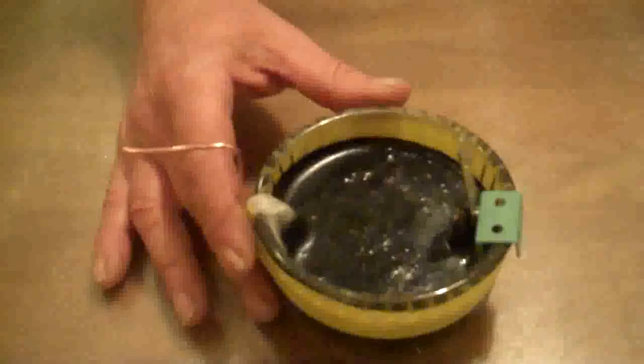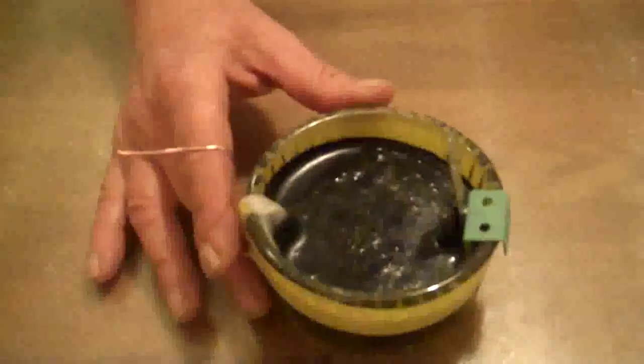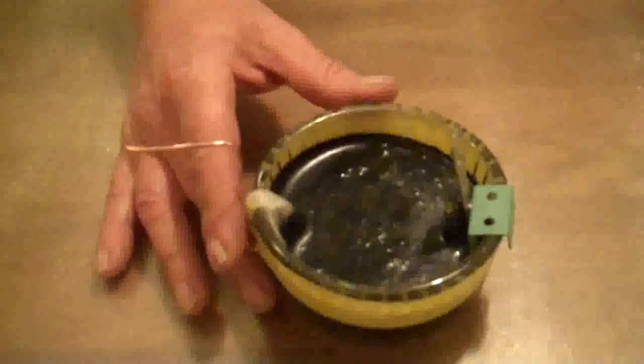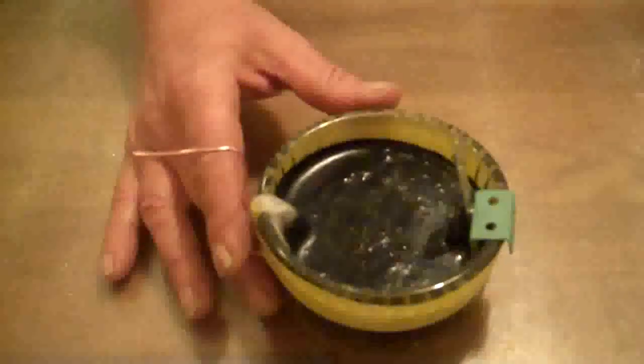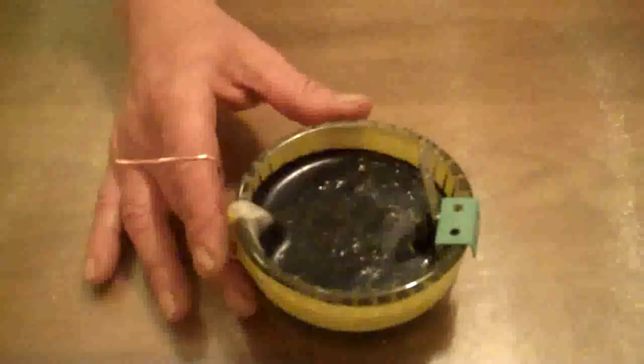Here it is after ten minutes — that's all it took. We have a nice film of graphene going down about half a centimetre or so. I can't think of a safer or easier way. That mixture in there was a very weak solution of sulfuric acid — 2.4 grams in 100 millilitres is absolutely nothing, so it's an extremely weak solution.